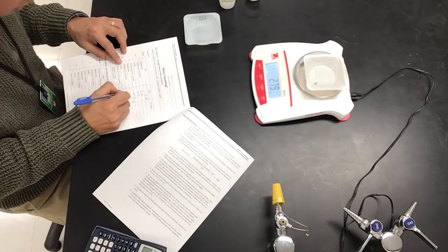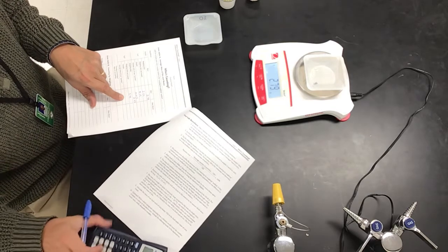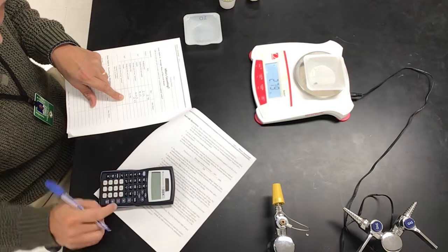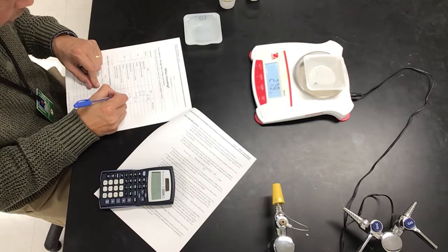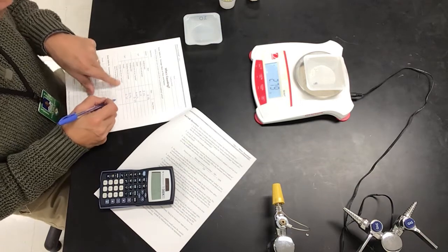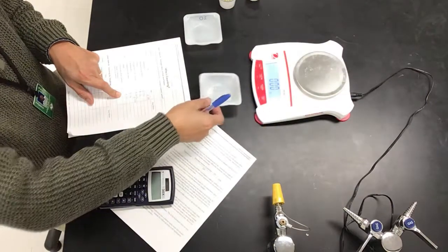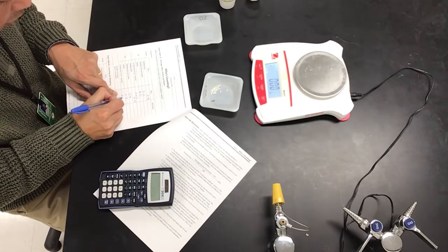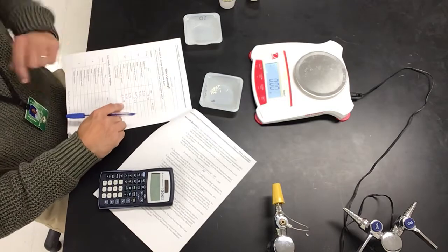Total mass is 2.79. To get the sample, I take that minus the empty one. 2.79 minus 2.44, I get 0.35. That's the sample mass. The average mass of 1 particle, I take that divided by 20 because there's 20 of them now. So 0.35 divided by 20, and I get an average of 0.0175. A little more precise than that. See, they're the same, just a little more precise.